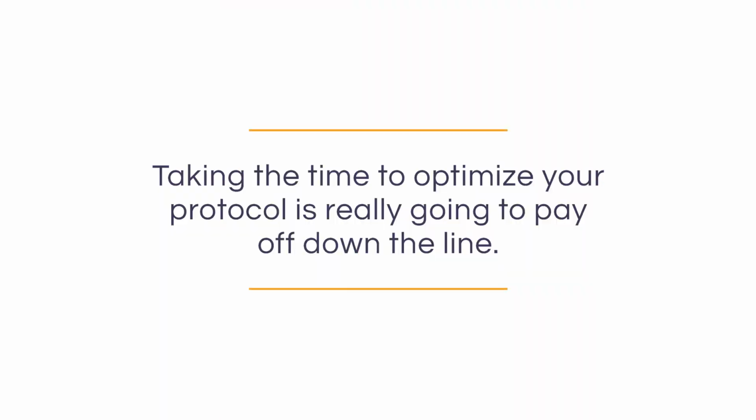But first, I want to assure you that taking the time to optimize your protocol is really going to pay off down the line. Don't settle for an okay blot. You want to make sure you optimize that protocol until you can get great quality data, accurate and reproducible every single time. Remember, there are several steps of this protocol that can be optimized.